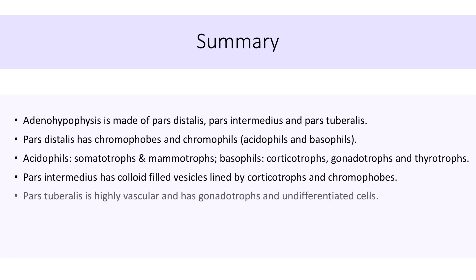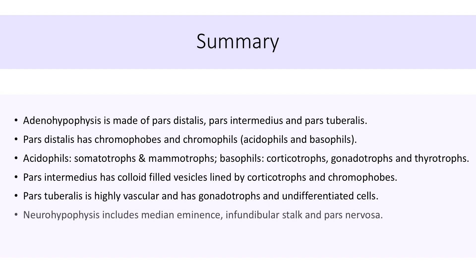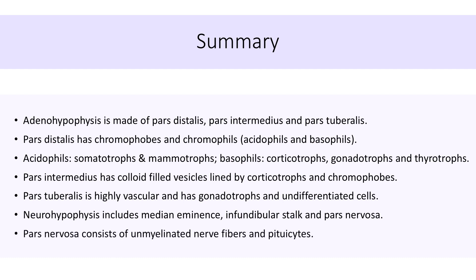Pars tuberalis is a highly vascular area containing gonadotroph cells and undifferentiated cells. Neurohypophysis includes median eminence, infundibular stalk, and pars nervosa. Pars nervosa consists of unmyelinated nerve fibers and pituicytes.